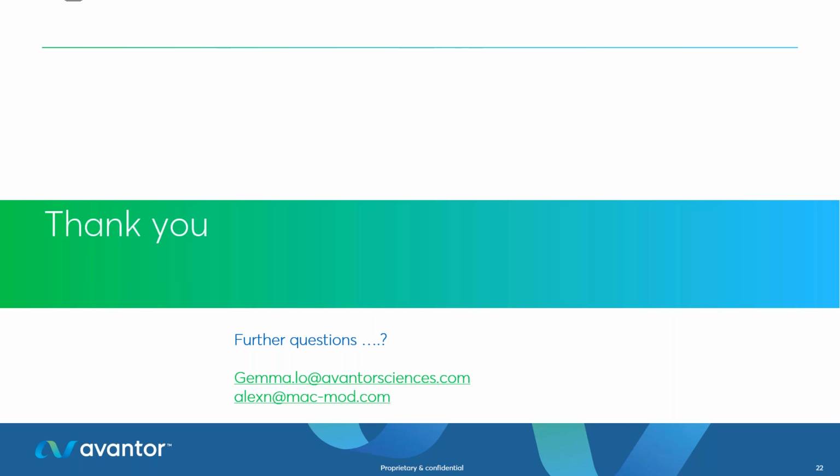First question, can I use acetonitrile with a PFP column? Great question. You probably saw some examples of us using acetonitrile with a PFP column through the presentation. There is some information talking about suppression of pi-pi interactions when you use acetonitrile. We've seen that you get significant differences in selectivity when you switch between methanol and acetonitrile, even with a PFP phase.